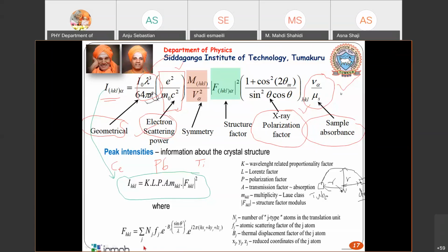I'm talking only about cerium oxide because it is very simple. In the same way, you can have TiO2, BaTiO3, so many other things, even intermetallics like gadolinium GdCoSi. This depends on the elements present in your sample.